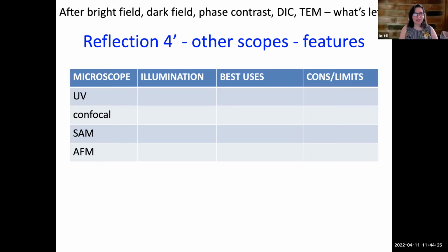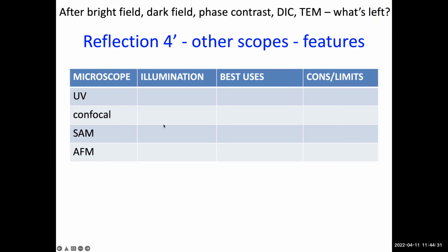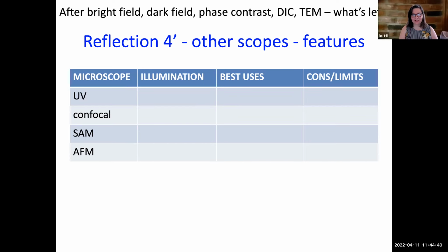That's an amazing feature. Courtney also had her hand up. What would you like to add, Courtney? I was just going to say that it uses a laser and that it's great for depth perception. Yeah, it uses a laser as its source of illumination, and the laser can often be in the UV wavelength. You can really decide whatever you want it to be, but it's usually in the UV wavelength, but it's actually more precise. We can get into lots more fun things about that. Andrew, what would you like to add?